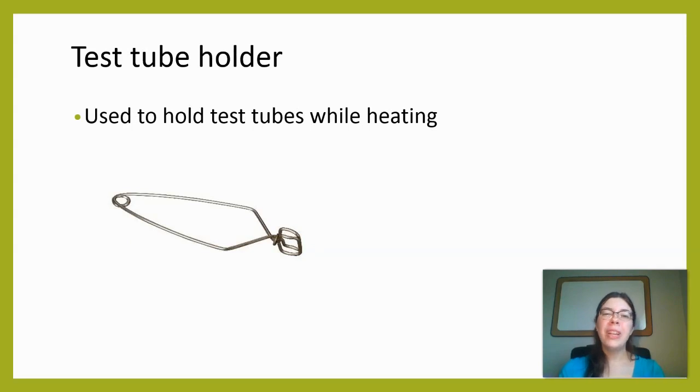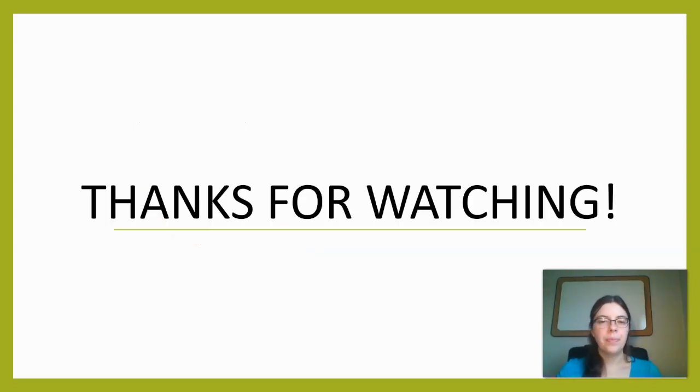So this is helpful if you ever need to heat something in a test tube. Obviously, glass gets hot when you heat it. This helps to keep a little bit of distance so you don't burn yourself. But basically, if you squeeze on the two ends of the test tube holder, that creates a little pincher that will pinch right around the test tube, so you can go ahead and put it into the flames.